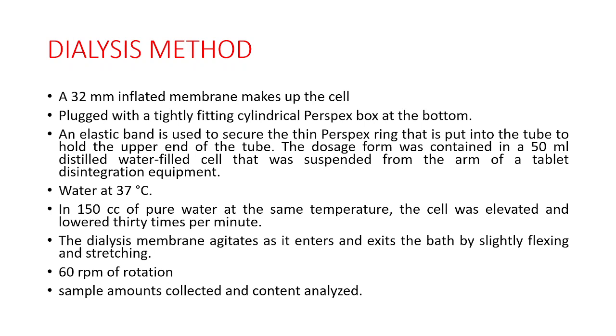Dialysis method. A 32 mm inflated membrane makes up the cells, and it is plugged with a tightly fitting cylindrical perspex box at the bottom. An elastic band is used to secure a thin perspex ring that is put into the tube to hold the upper end of the tube. The dosage form was contained in a 50 ml distilled water filled cell that was suspended from the arm of a tablet disintegration equipment, in water at 37 degrees Celsius in 150 cc of pure water at the same temperature.